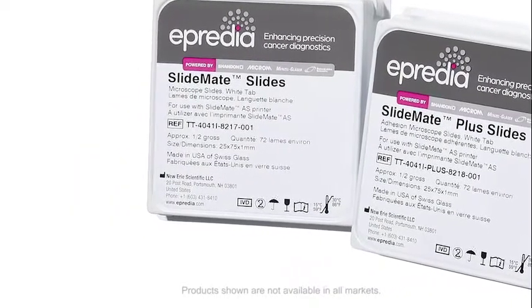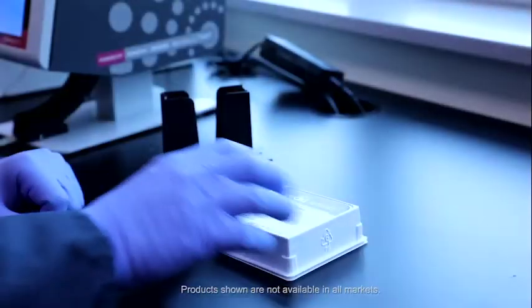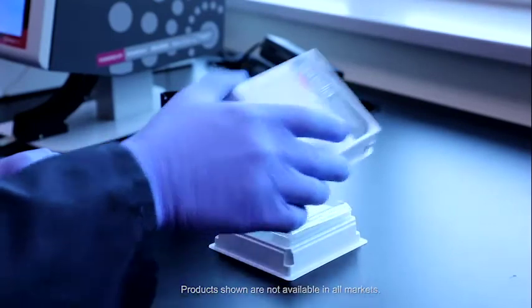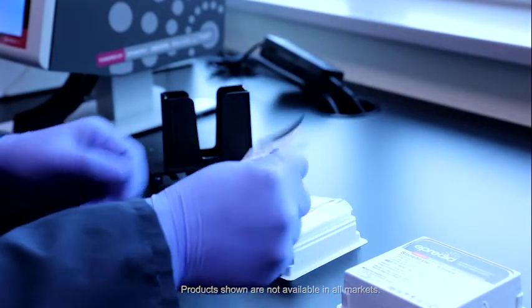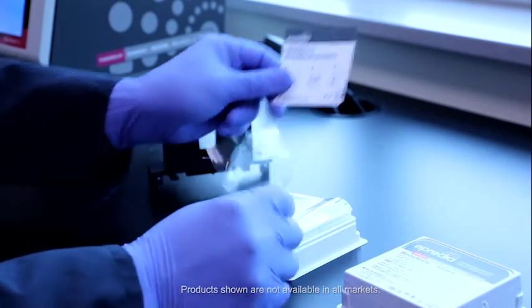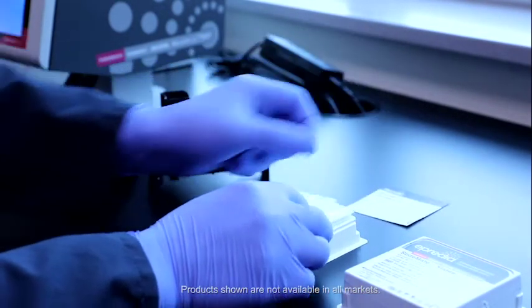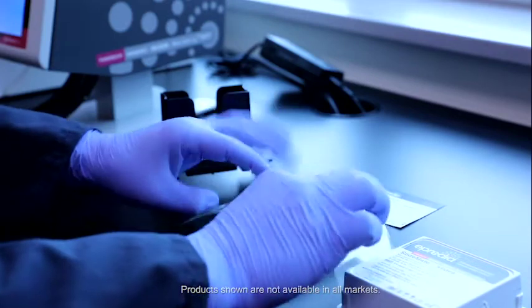SlideMate slides feature a smooth printing surface designed for high quality, crisp printing when paired with our SlideMate AS and SlideMate Pro printers.